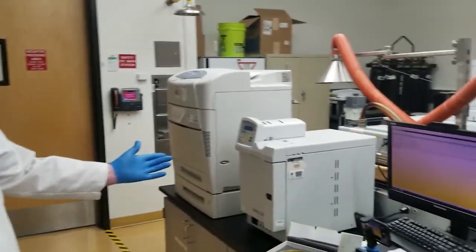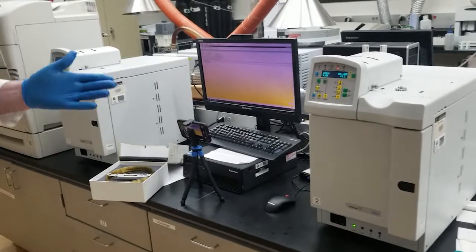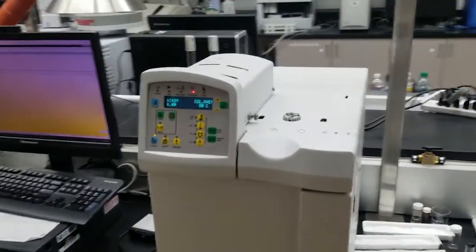Hi, so this is Professor Garner. I'm going to help you guys do some instrumentation using the gas chromatograph. So we have actually two gas chromatographs that are hooked up to the same computer system. One of them is on and hot and ready to roll.